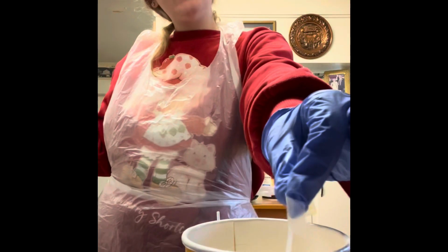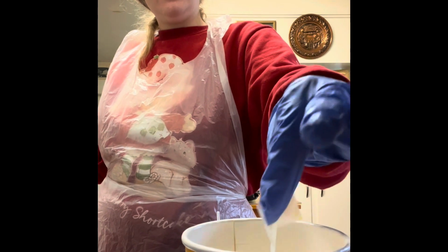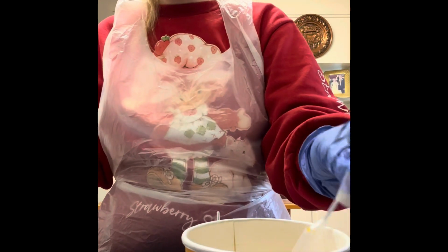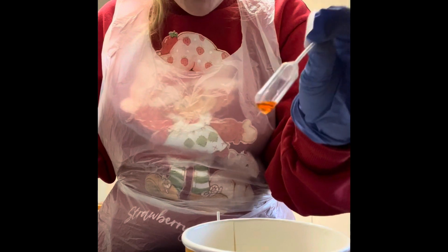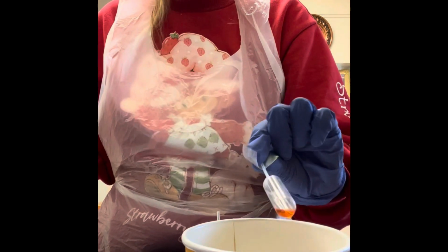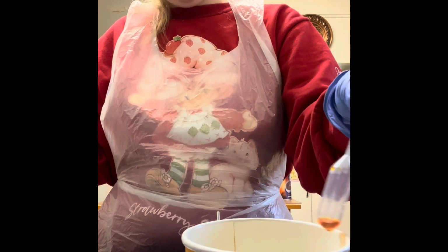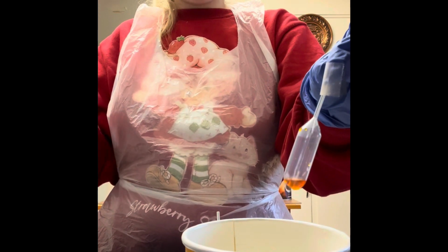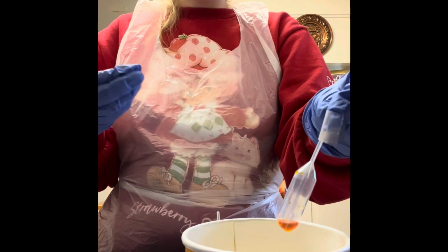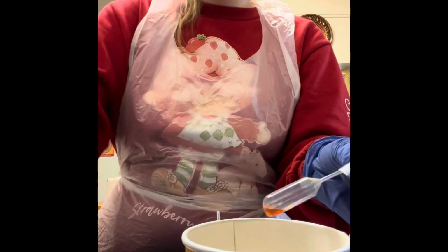Okay, it's time to take my pipette out of its hot bath. I just took the tape off of it. And it's time to lift her up and see what she is doing. Oh, there is definitely a notable difference in the color. I'm seeing a reddish orange now. And I see that it's all liquid. So I'm going to go with right shift because that means that it's going towards the product. And the solution's all liquid. That's pretty much all that I see.